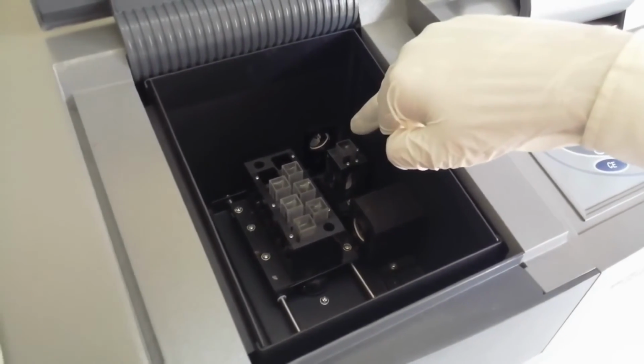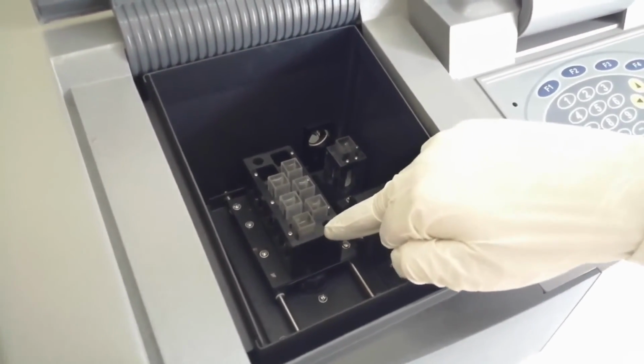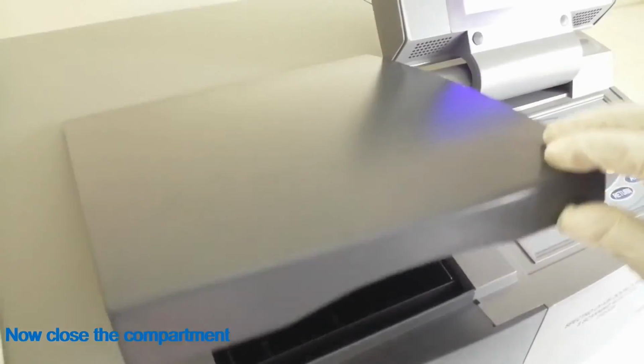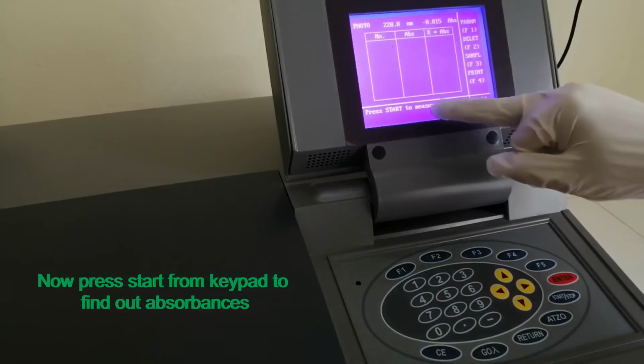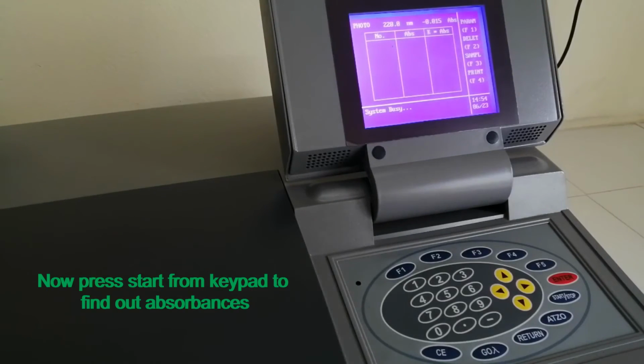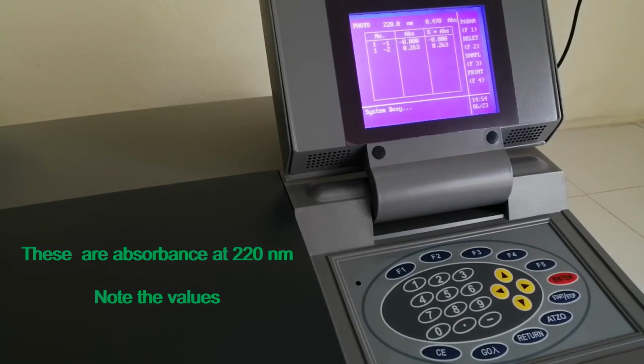In this way, we put all sample, blank, standard and reference. Now close the compartment. Now press start from the keypad to find out absorbances. These are absorbances at 220 nanometer. Note the values.